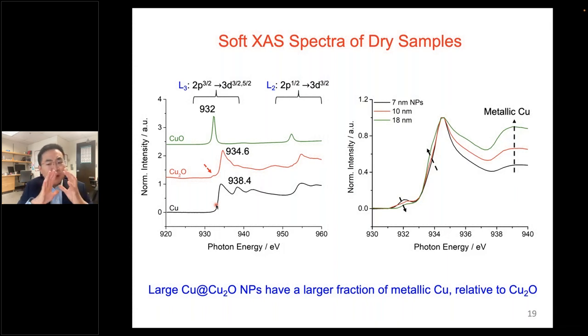And typically, a soft X-ray spectrum, depending on the sample concentration, may take anywhere between a few minutes up to 1 hour to collect the whole spectrum. That is fairly time consuming. That also means the sample has been under intense X-ray illumination for a long time, which would come with the concern of beam induced damage.